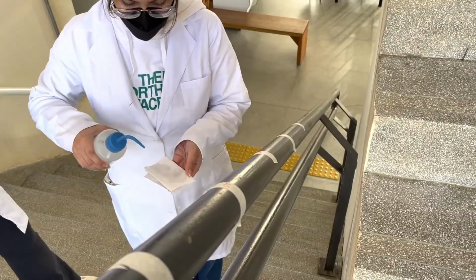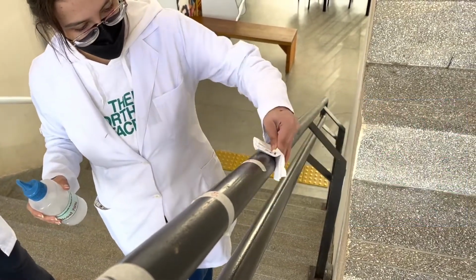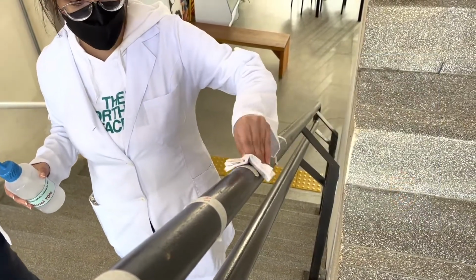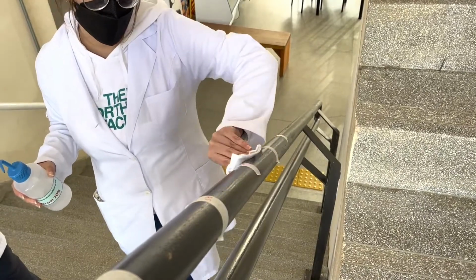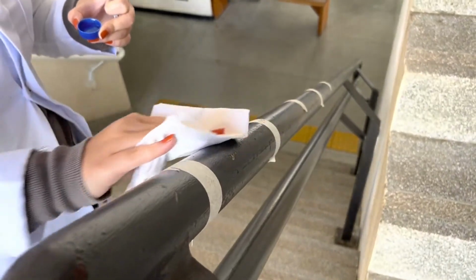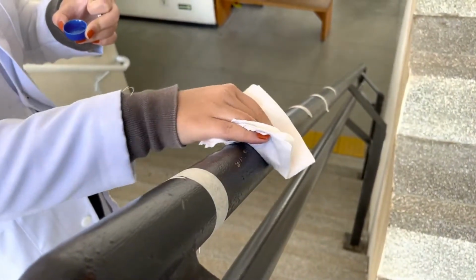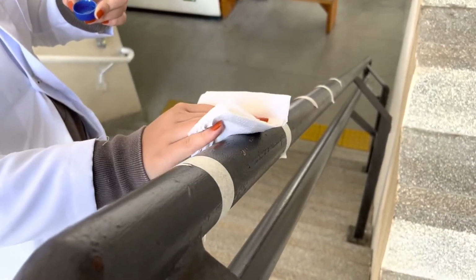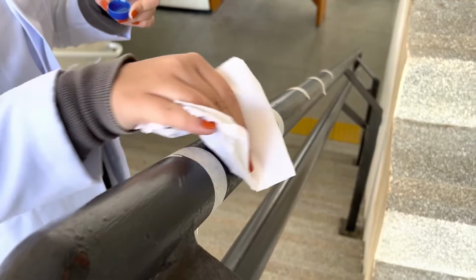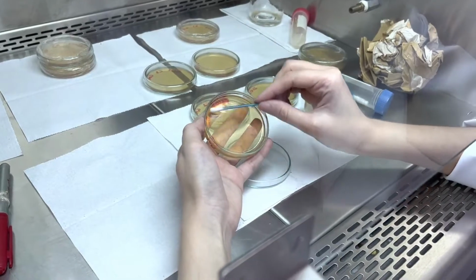The cleaning was performed according to the indications of the government of São Paulo, found in the booklet of Fundação Casa, and in the Manual de Orientações de Limpeza, Higienização e Conservação das Unidades de Saúde, by the Military Police Department of Distrito Federal. These documents were chosen based on the standardization of activities oriented towards environmental hygiene in contaminated places, in order to minimize the risks of transmission of microorganisms, ensuring comfort, hygiene, and well-being to users of such places. The samples collected were swabbed in the petri dish just like we showed before.